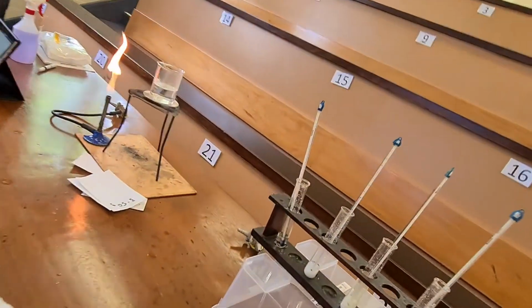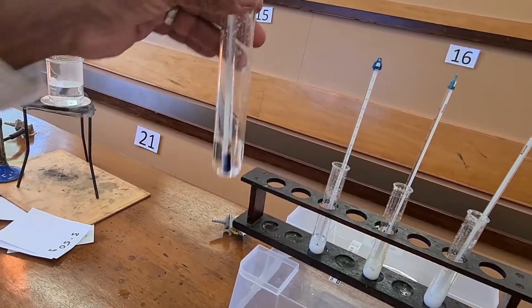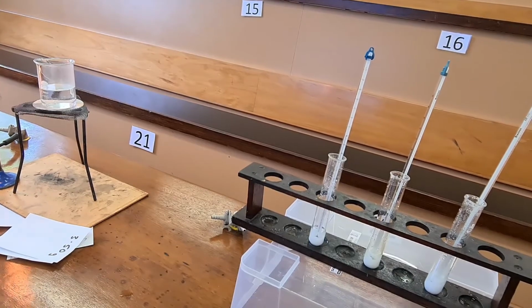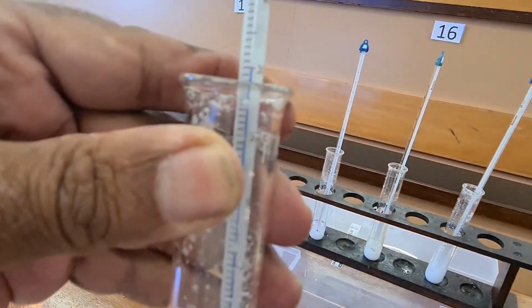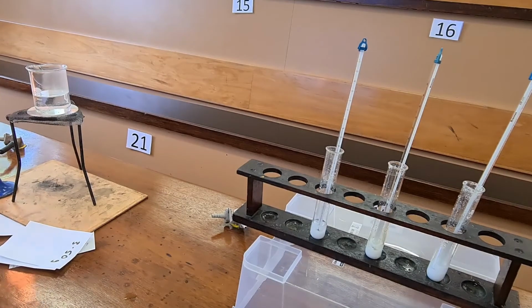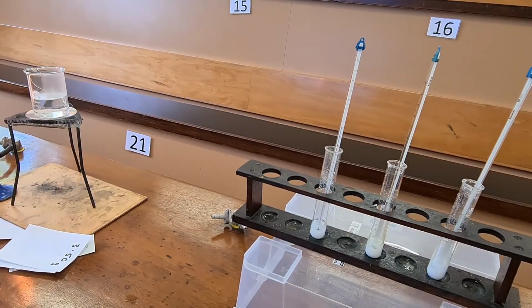Now, it'd be nice to get A. Still not forming. Temperature is 30. I suppose with the room being 25, it's going to take me putting it under running water.